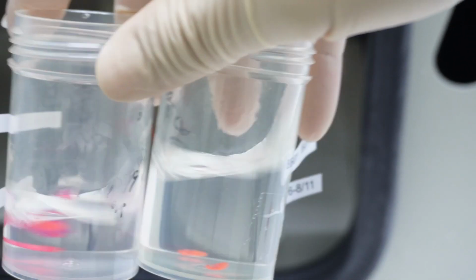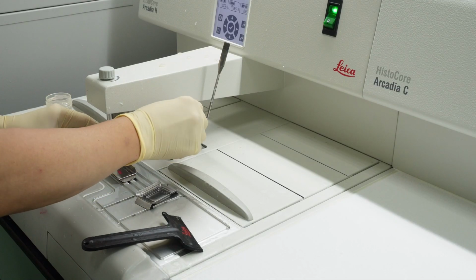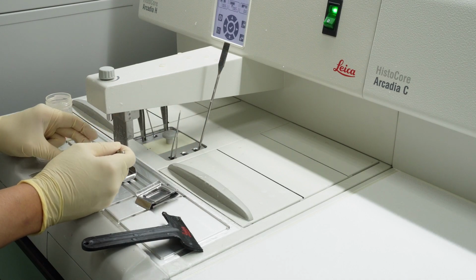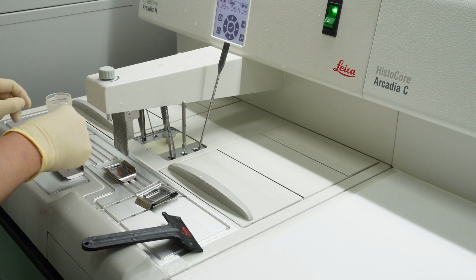And the warm wax seeps into all the spaces. It infiltrates everywhere throughout the tissue, replacing the Lemosol A. Okay, so the tissue is now full of liquid wax. That leads right into embedding, I imagine. It does. The goal now is to take that paraffin-infused embryo and make a solid block of wax around it. That block is what you'll eventually slice.